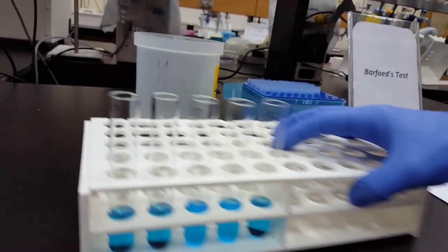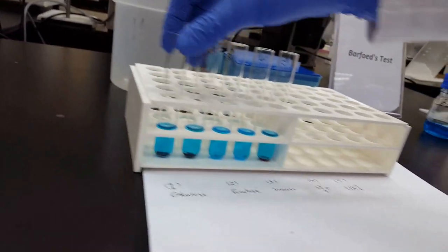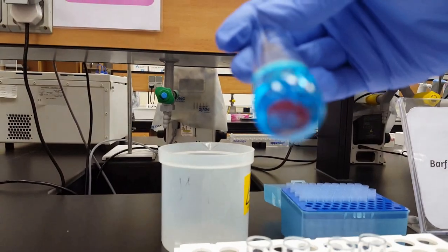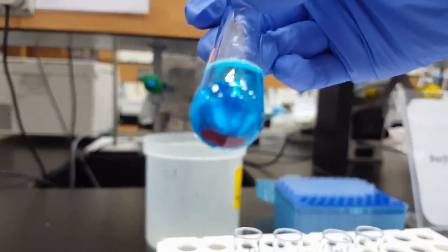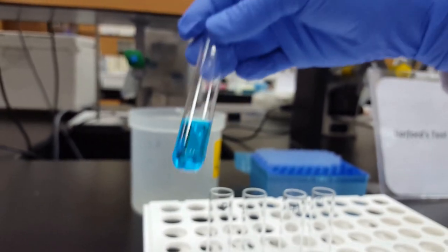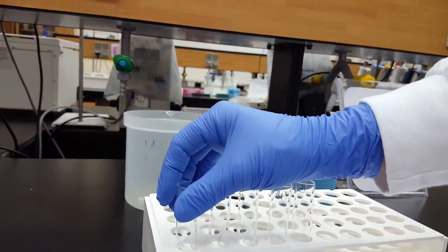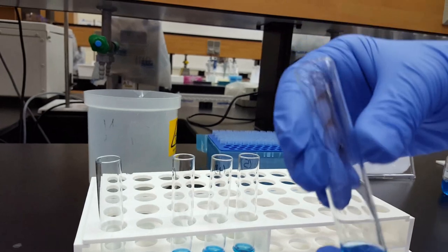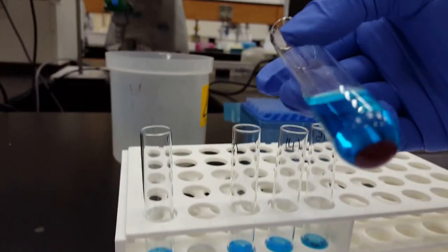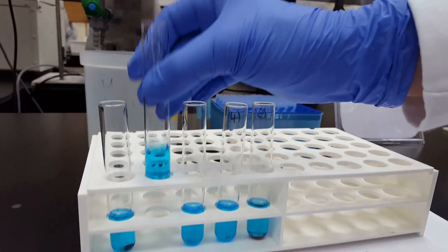Then after this incubation, we will refer back to our setup and see which one is positive. Can you see here in the first test tube, we can see a red precipitate of copper oxide. So this indicates a positive result for a monosaccharide carbohydrate, because it's actually glucose. What about the second test tube? It has fructose. Fructose is a monosaccharide, and you can see here the positive cuprous oxide precipitate.